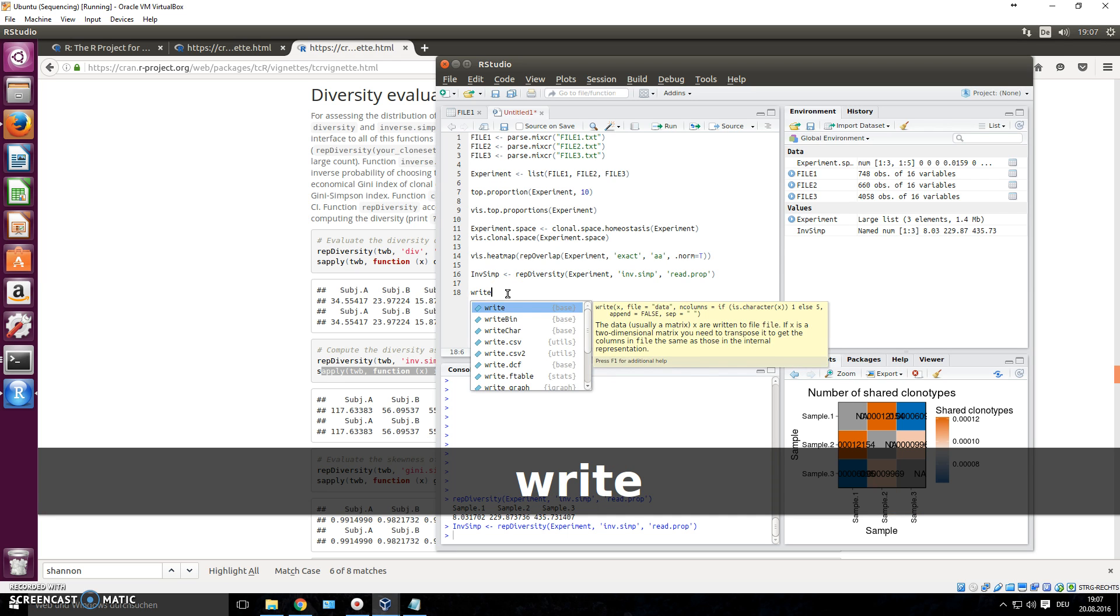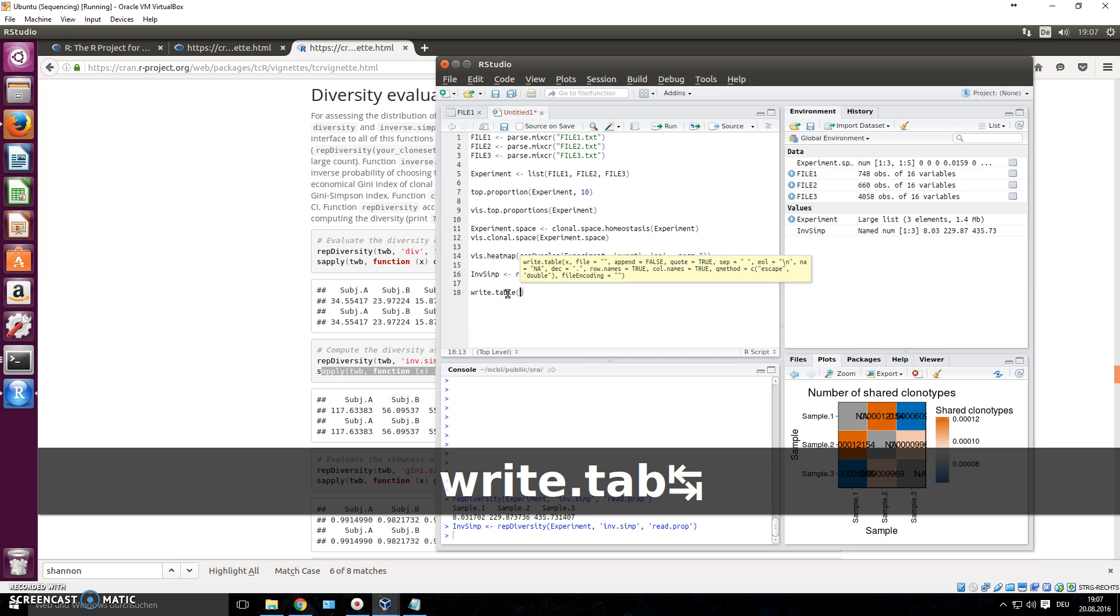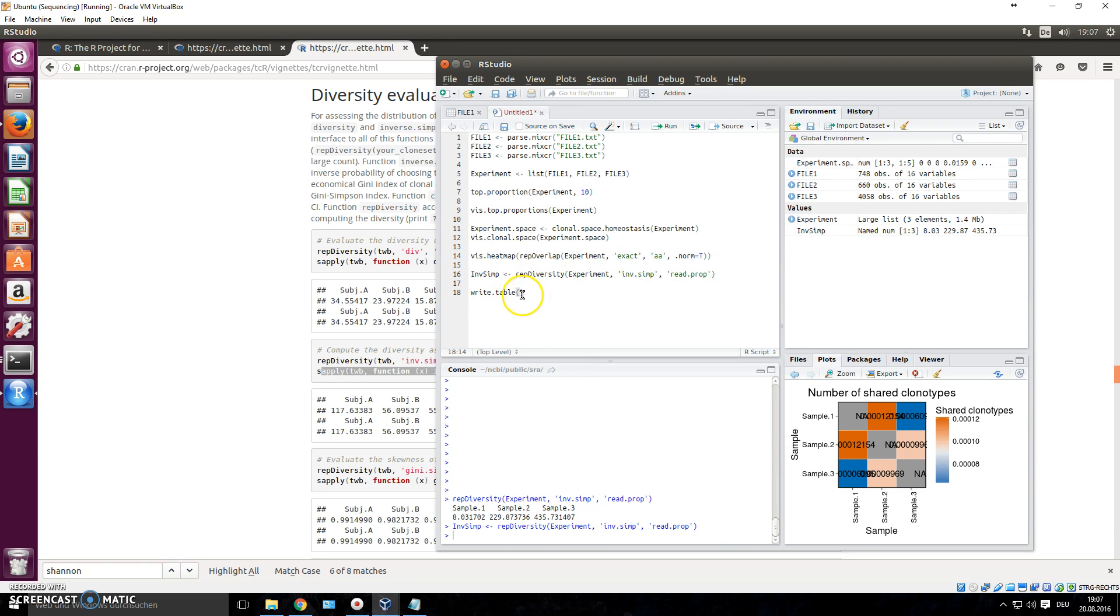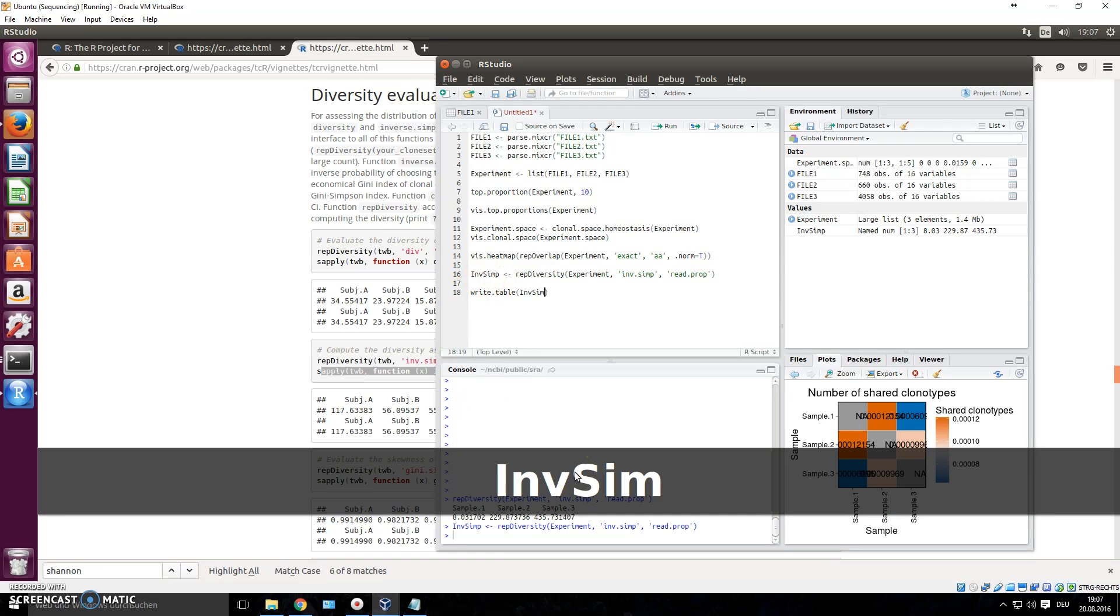And now let's write that into a file. So write.table, you can see that. Now what we do is we write table and we first say what we want to write, we write this, our object right here. So inf_simp, we call for object.